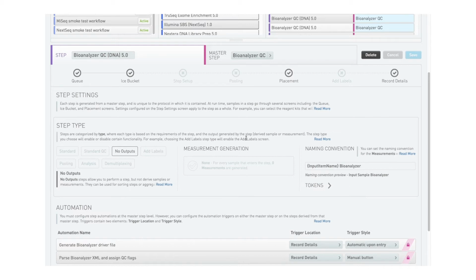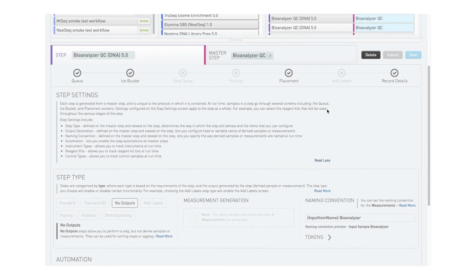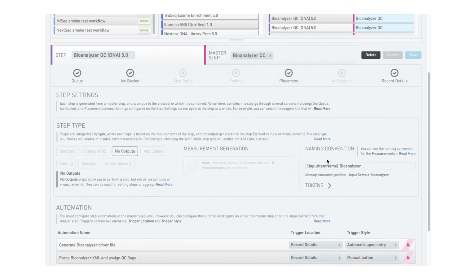It's not easy to remember the nuances of all of these pieces. So what we did was we put the information right in the page so you don't have to click out anywhere or Google anything. To read the whole description, you just hit this button here, Read More, and the description will open up for you to read. When you're done, you can say Read Less and you don't have to see all of the description anymore.